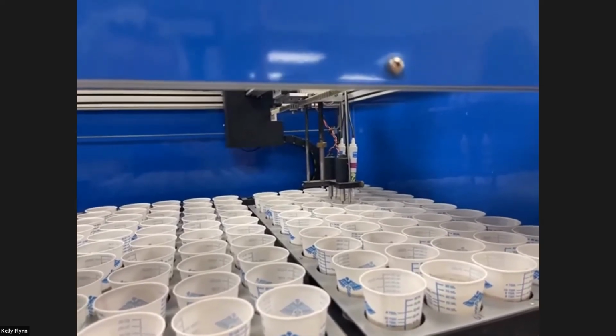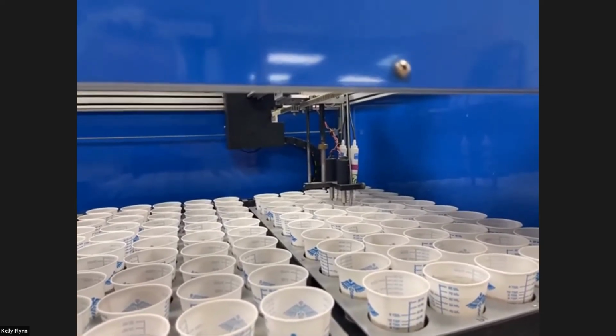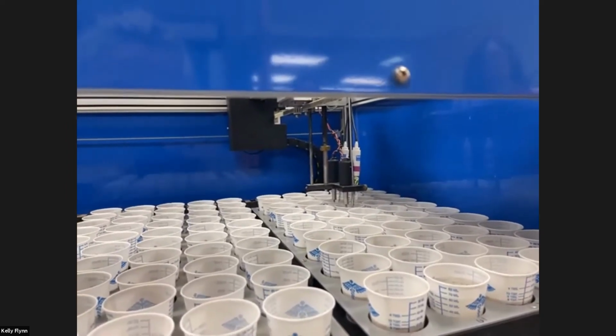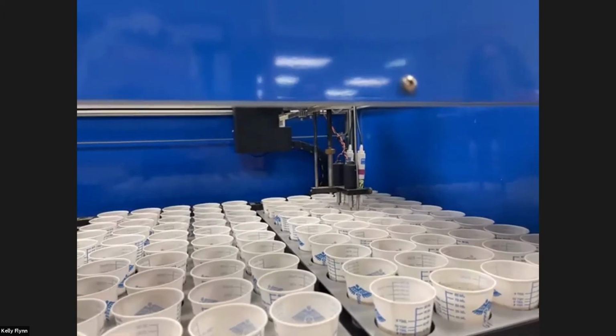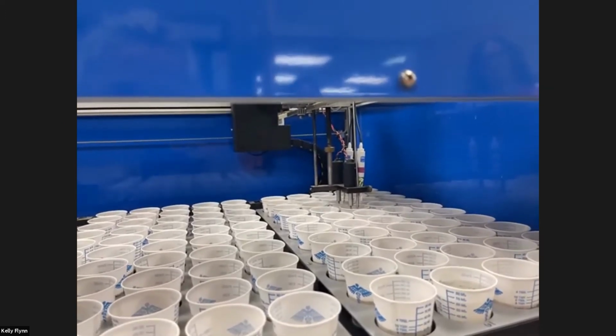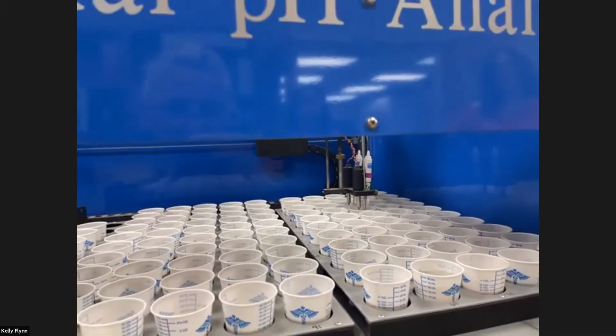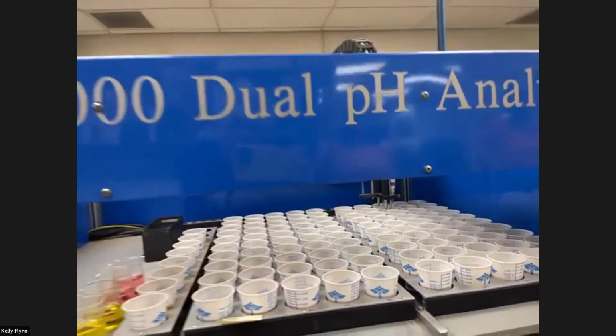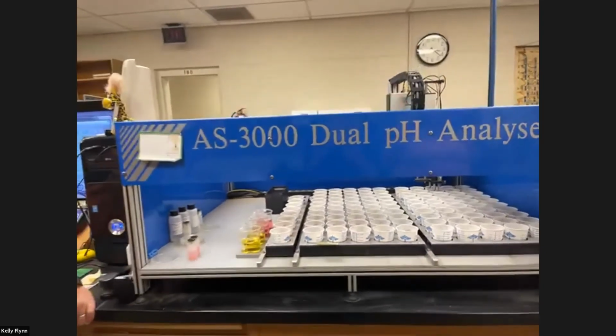So it's actually taking readings right now. And then there's a program that will take those readings, and it takes like 10 to 15 different readings while it's in there. And then basically it forms kind of an average, if you will. Now it moves from sample to sample. We don't have that much carryover from cup to cup.